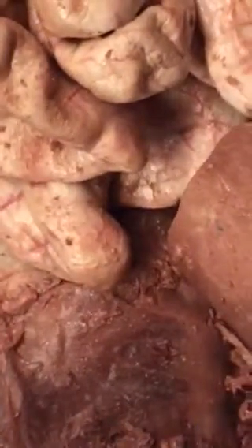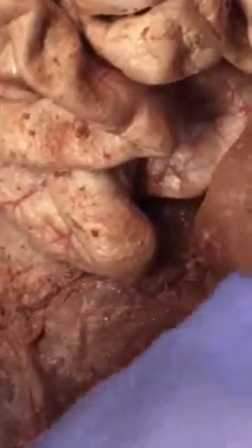You have two kidneys. So the kidney is in a renal capsule that you can take off. And there's a bunch of fat around it. Depending on your cat, there'll be more or less fat. So you got to clean it up to find it. Okay, but it's this kind of egg-shaped structure here.